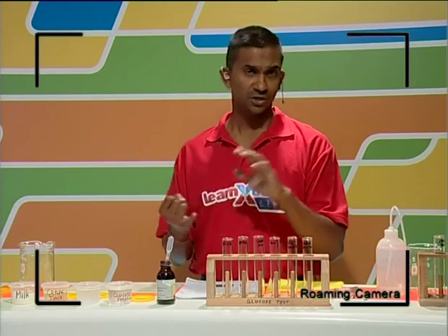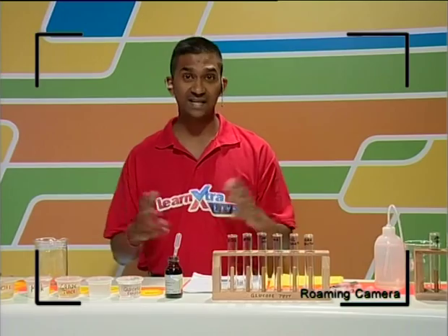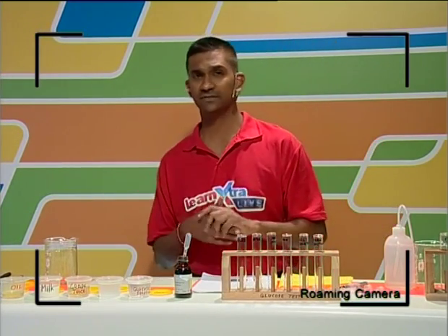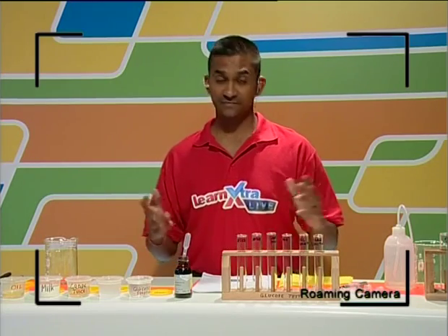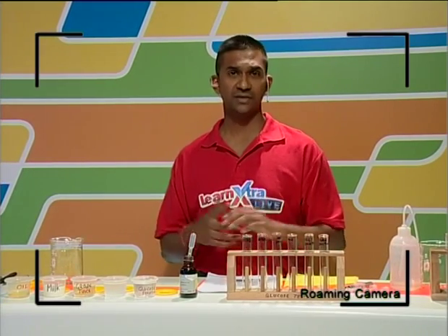necessary precautions. You don't smell any of the contents, you don't sniff any of the contents, you don't taste anything that you have, and that's important. And ensure that your windows and your rooms are well ventilated. And always guys, do an experiment when your teacher's around, so that if something goes wrong, your teachers know exactly how to correct them or how to react in a situation.